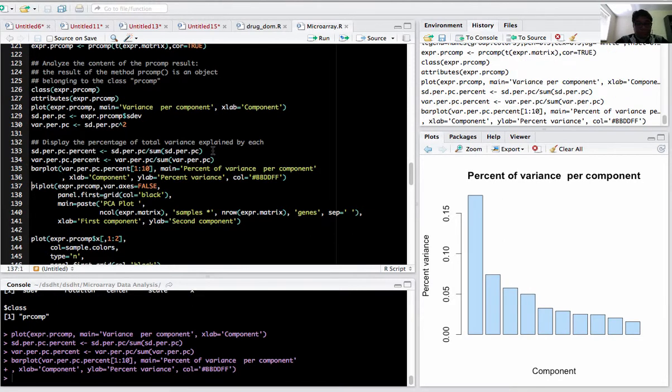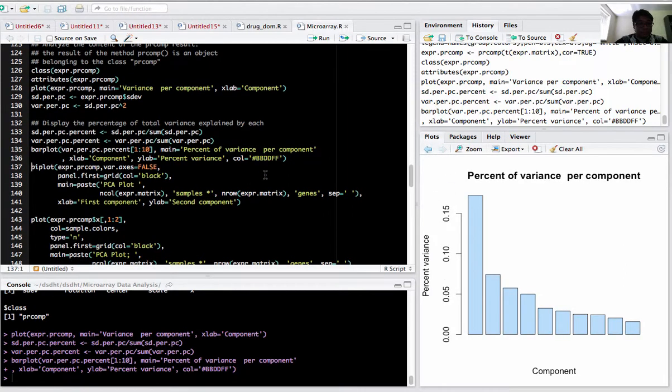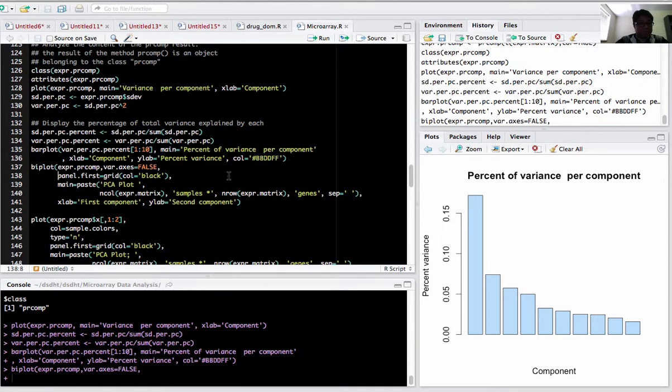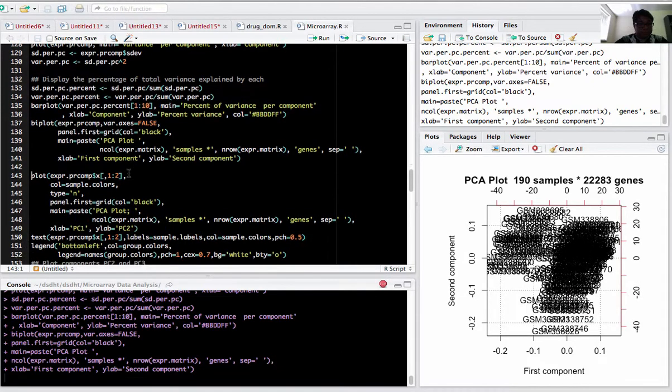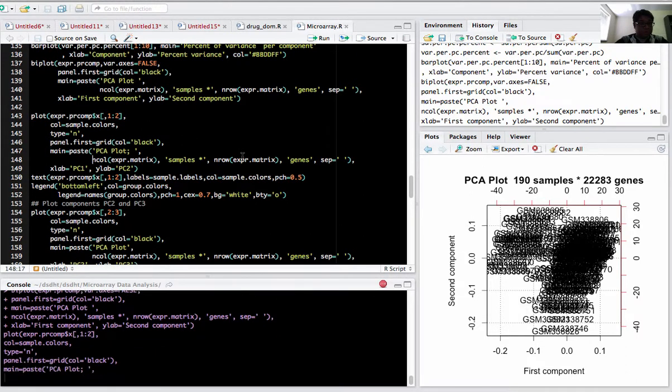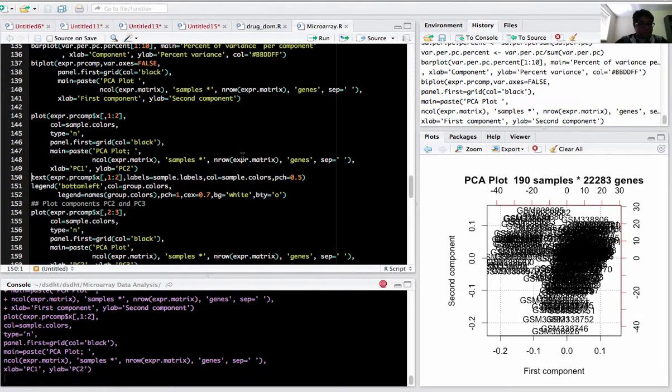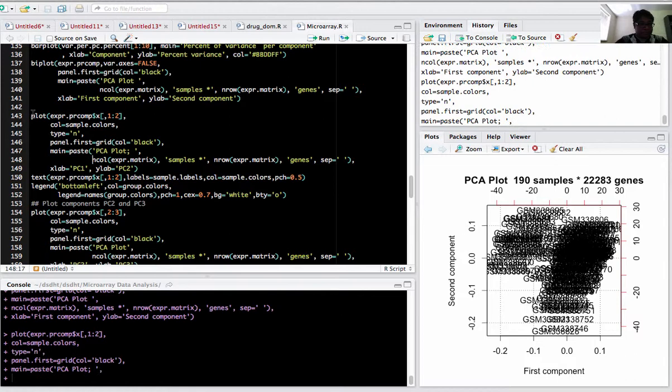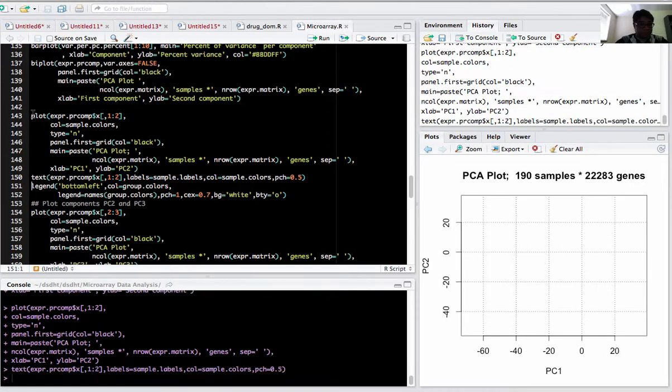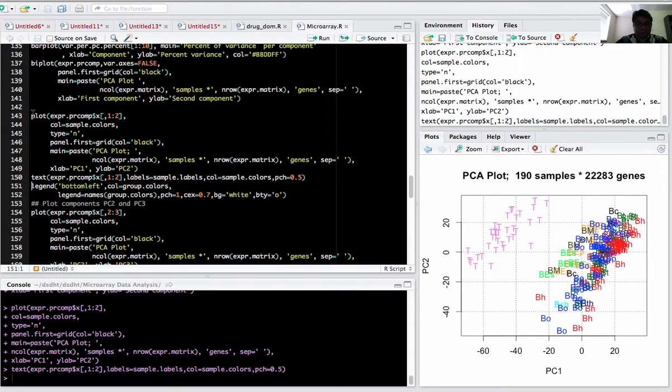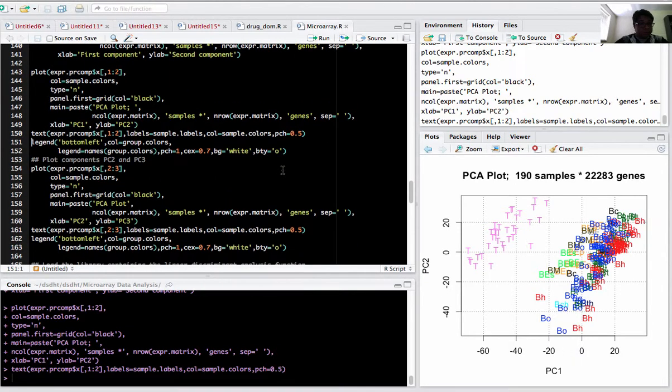This is the percentage variance for each component. The biplot function plots the principal components - component 1 and component 2. There are other ways to plot the principal components; you can use the plot function also. PC1 and PC2 is plotted here, where you can easily see the T group are separated based on the PC1 and PC2 components.